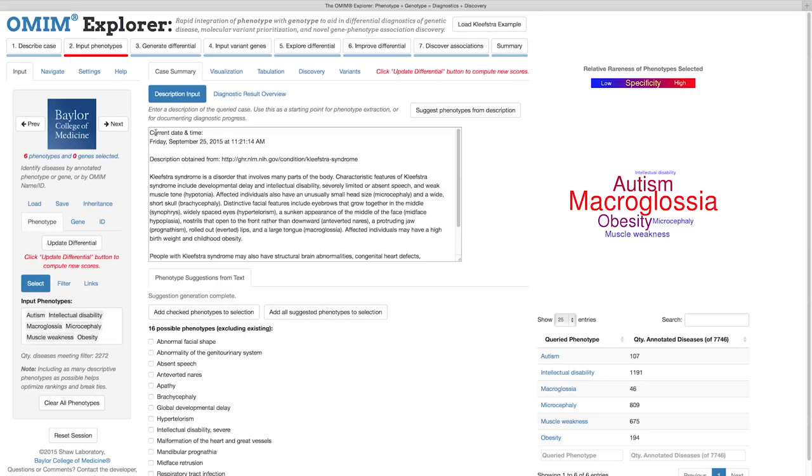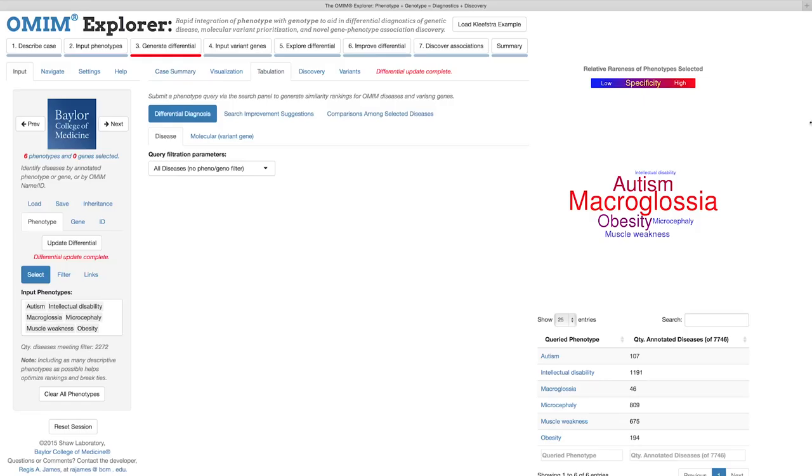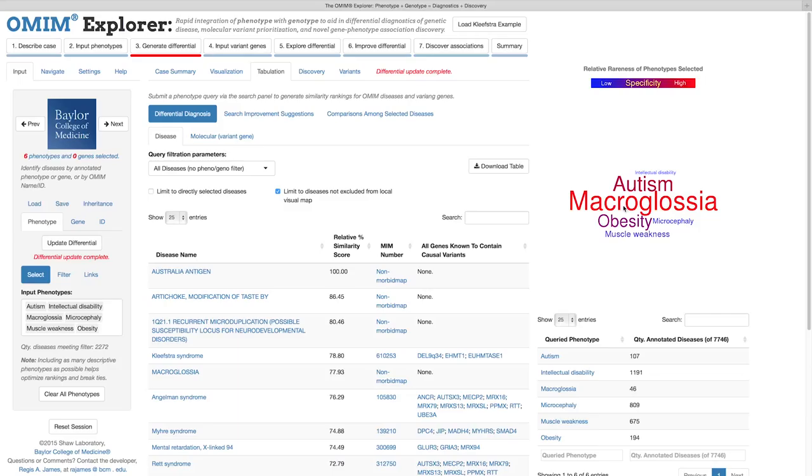Let's advance to the next step. Step 3. Generate Differential. By clicking the Next button, which takes us to the initial differential diagnosis. The ranking in this differential is from the semantic similarity match scores computed between the phenotype query we just entered and the thousands of diseases annotated with HPO terms.